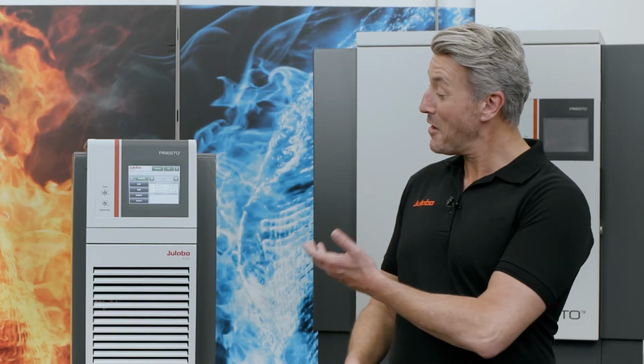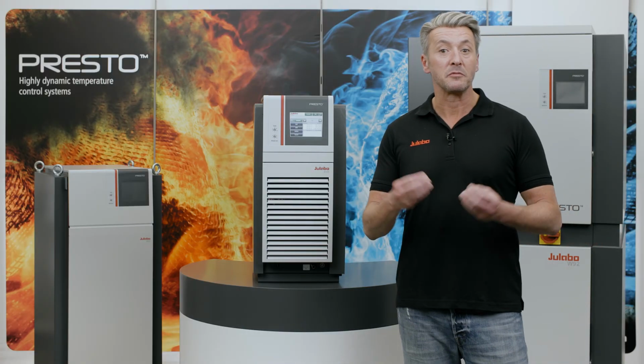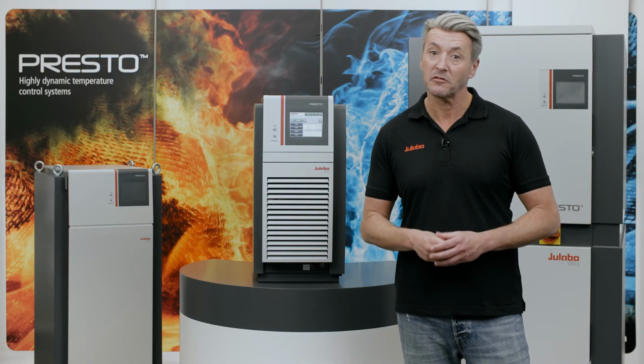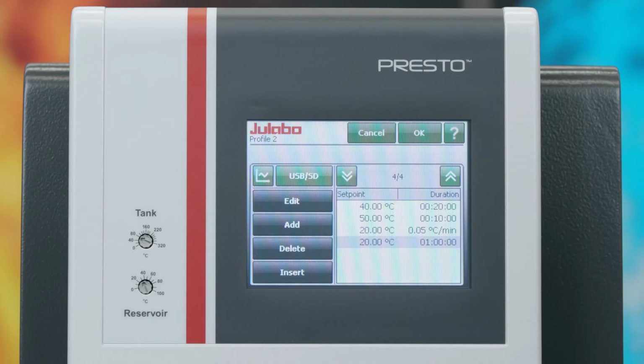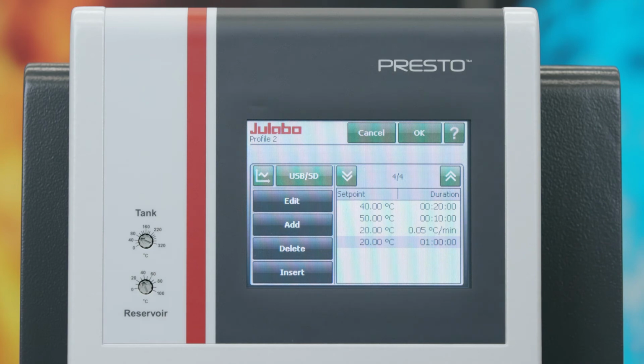That's it! The profile is now ready for use. Of course, the times can only be achieved if the performance of the PRESTO is sufficient for your application. In the sub-menu, you can review all steps in the desired order.